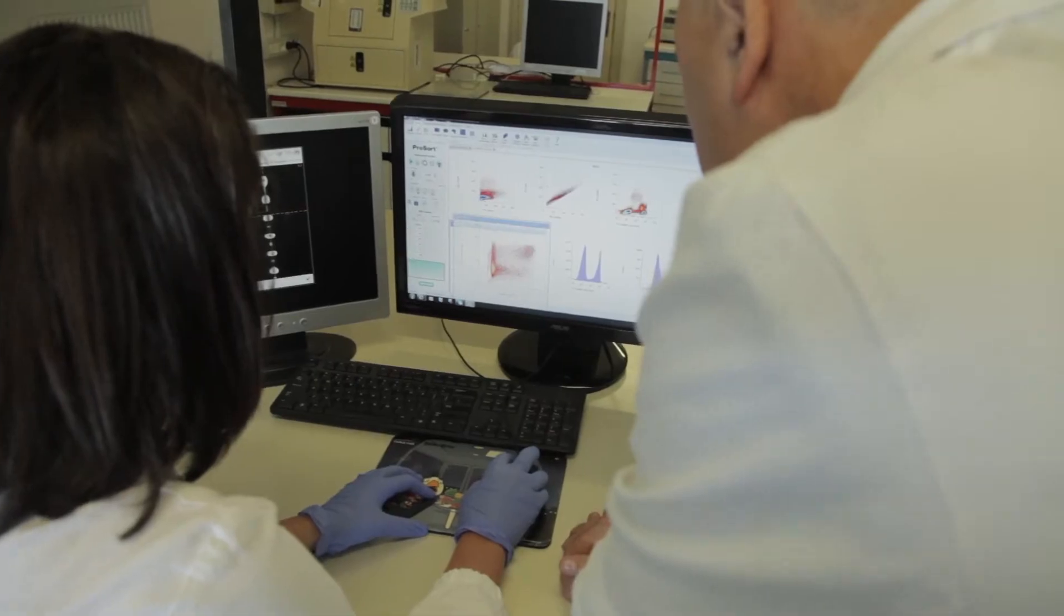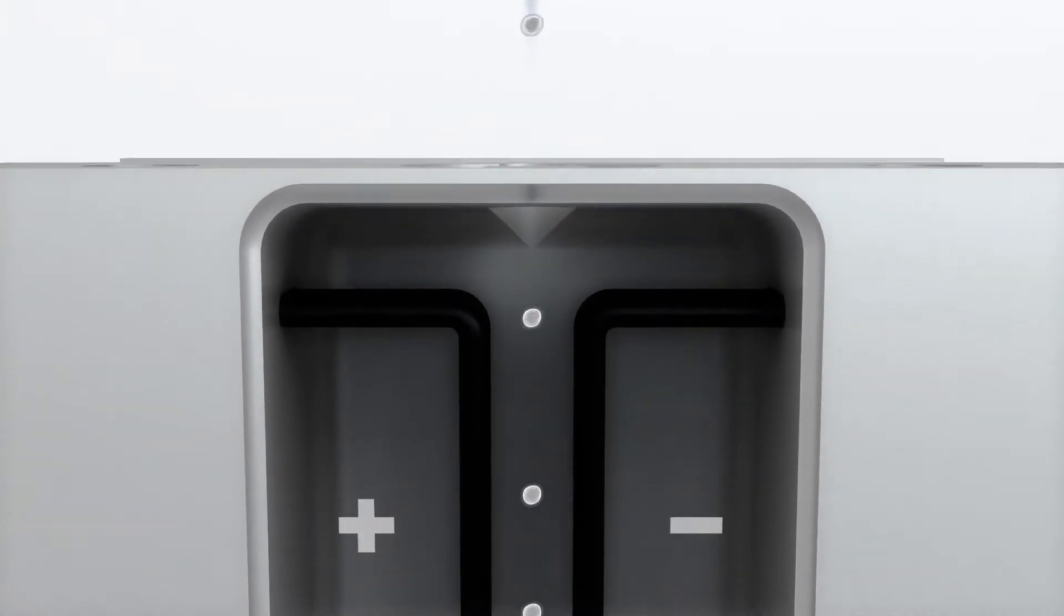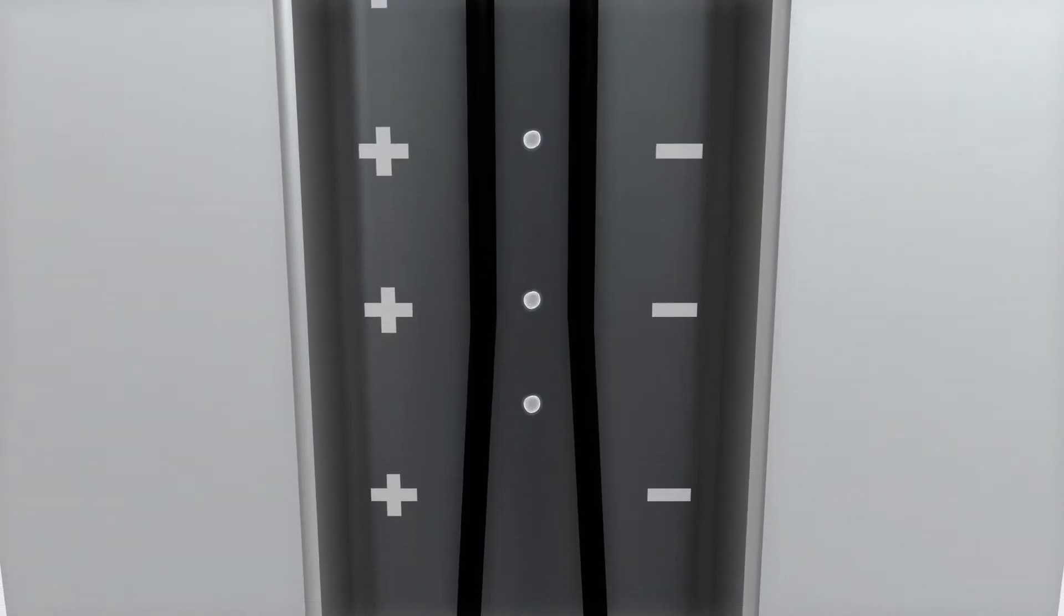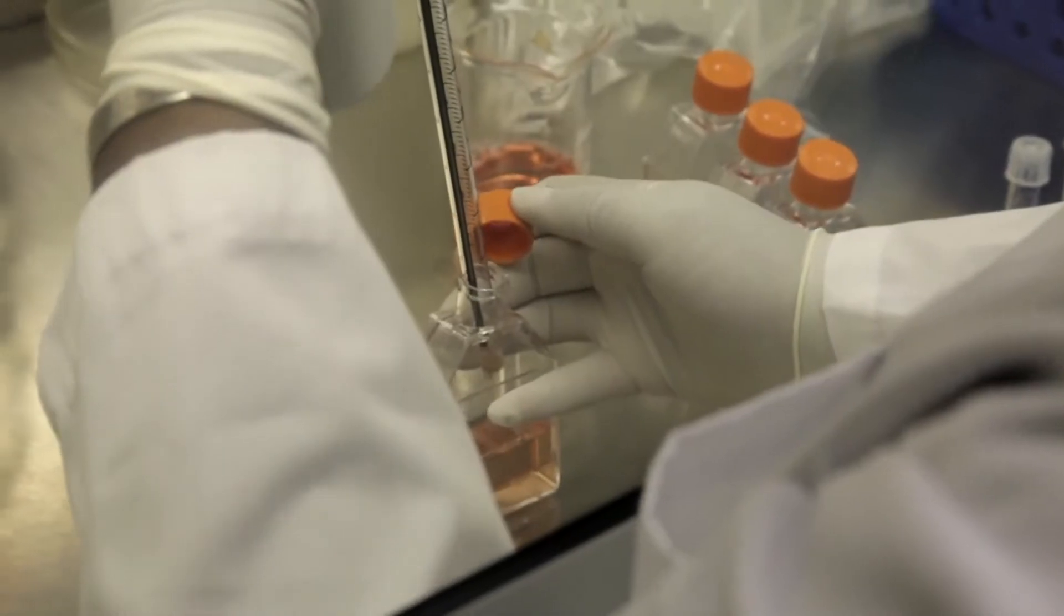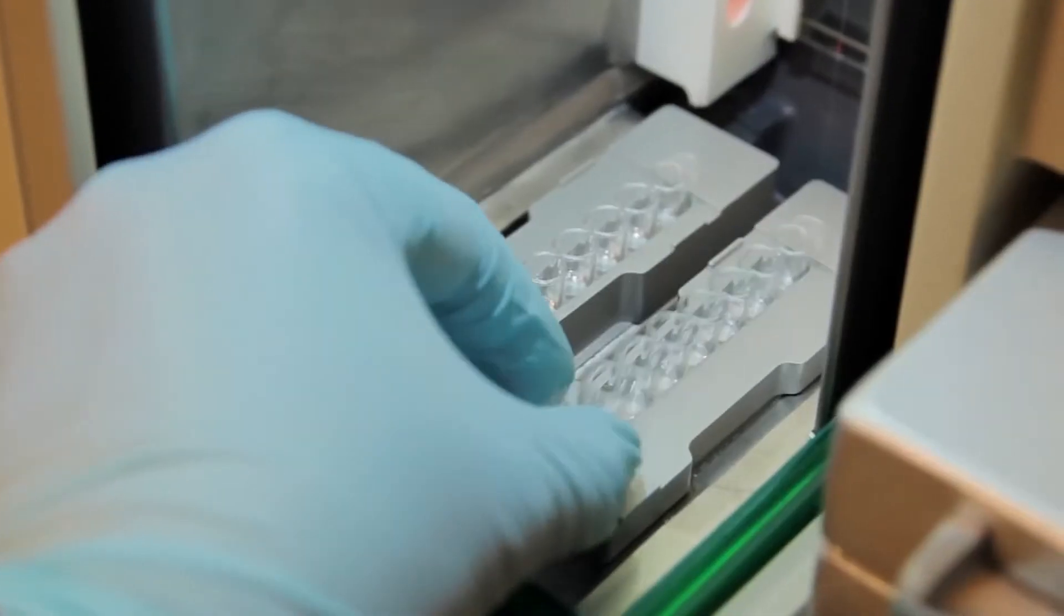And you get superior performance and sample quality. The S3E is fast enough for rare cell sorting, but gentle enough for the isolation of delicate cell types. You'll get better results and feel more confident about your data from using fresh, pure cells that have never been frozen.